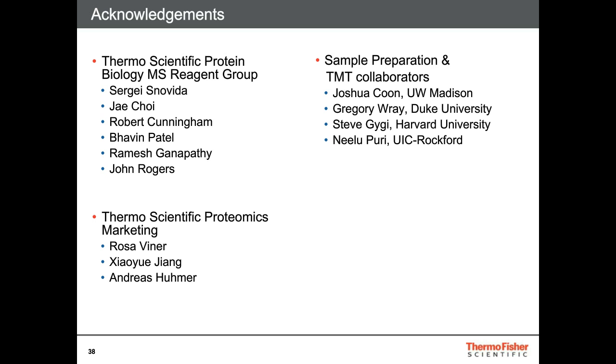Yeah, sure. I think peptide normalization after your sample prep is probably one of the key problems that I see with the majority of sample prep today. Although you may measure the protein concentration of each sample prior to reduction, alkylation, and digestion, there's a lot of variability in the cleanup, especially using homemade devices. And the numbers that you get when you're doing either protein identification, and especially when you're doing quantification in the instrument, is highly dependent on the amount of sample that you load on your analytical column.